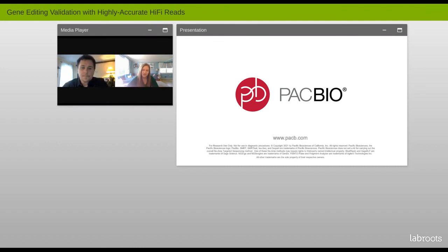Can you comment about some of the differences between short and long read technologies and what some of the pros and cons might be for each? Sure. So we've seen a lot of people leverage long reads, right? And the primary differences they've been able to achieve against some of their short read approaches have been detecting truncations and fusions, right? This single molecule resolution allows you to investigate these types of things and span that whole gap. Again, we're using super long reads to cover lots of things, and the fact that you can go around and around the molecule and get that consensus accuracy can give you pretty good confidence around what's in the population, in the mixture, right? We've done early publications where we spiked it in on purpose, right? We had all these truncated genomes and a lot of different types of things packaged to understand the resolution that we could detect. And I think that's been the primary piece to it, yeah.